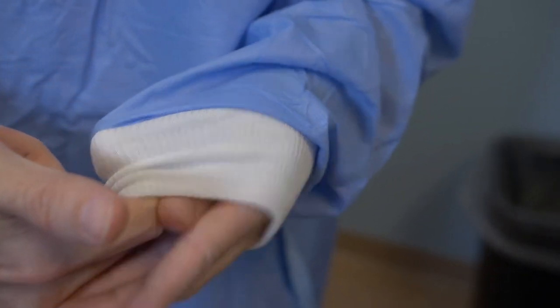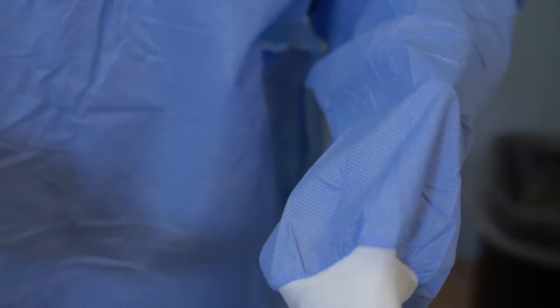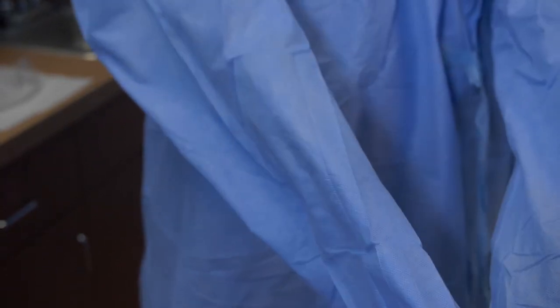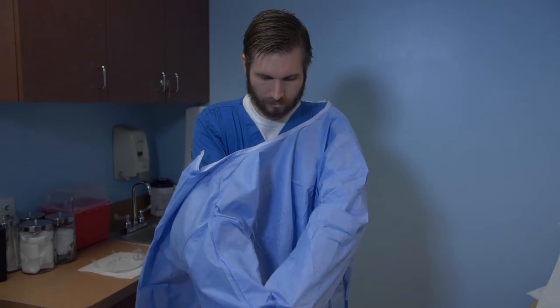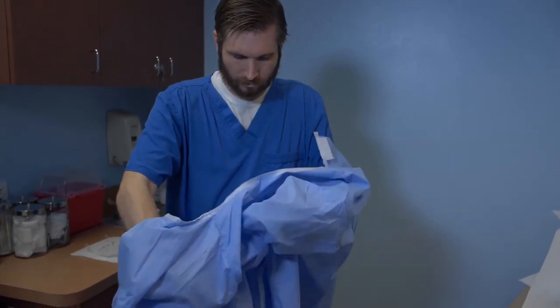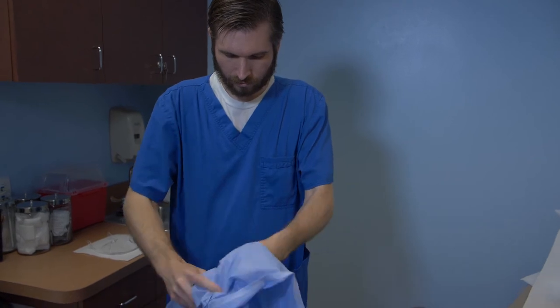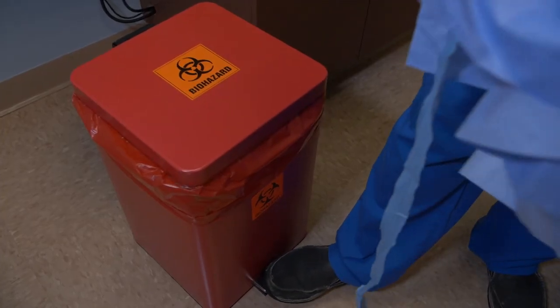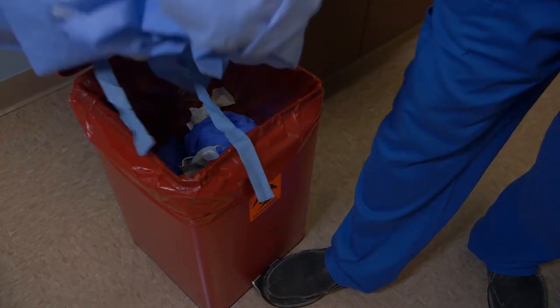Pull the gown over the hand, being careful not to touch the outside of the gown. Using the hand that is now covered by the gown, pull it down over the other hand. Pull the gown off of your arms, holding it away from your body and rolling it into a ball with the contaminated side inside. Dispose of the gown in the appropriate receptacle and wash your hands thoroughly.